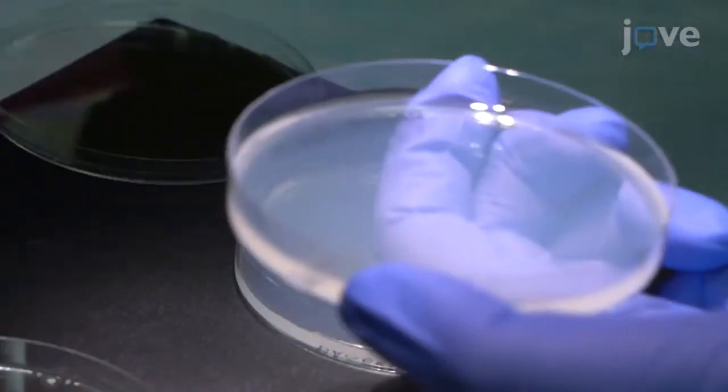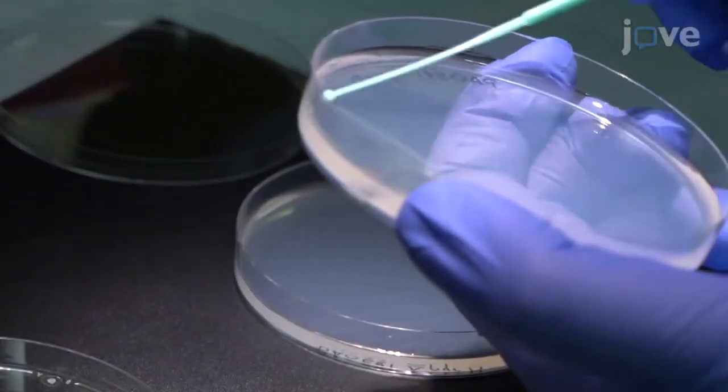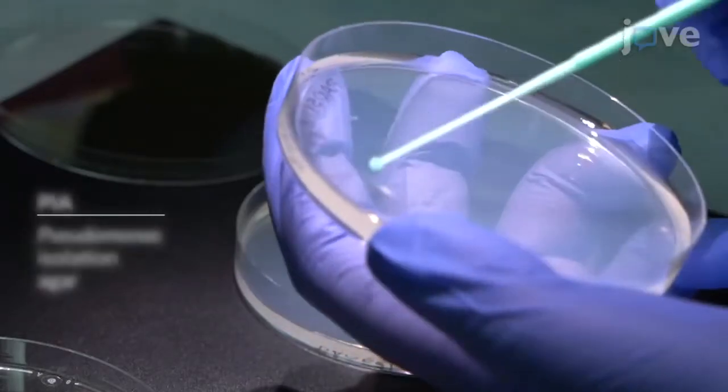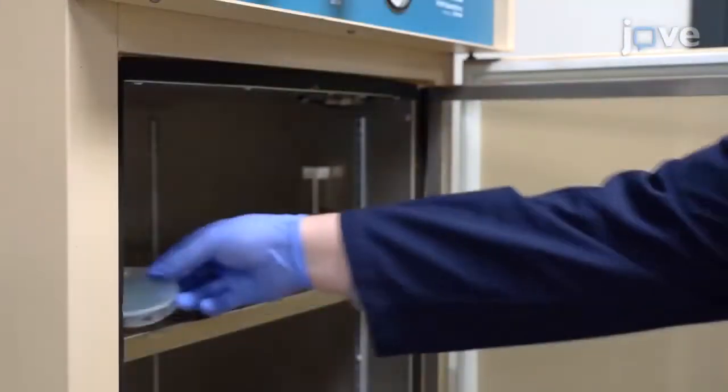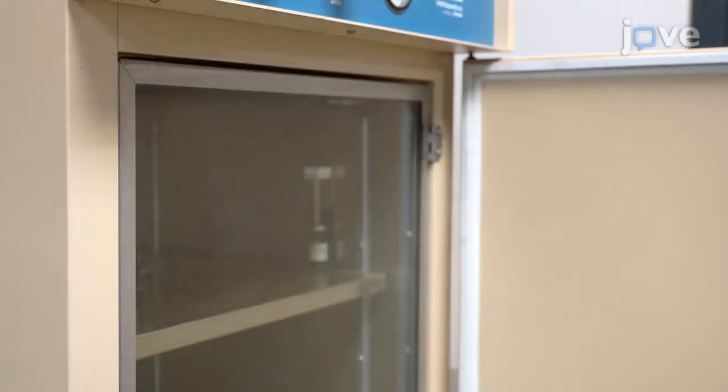To detect the small colony variant, or SCV, first treat the P. aeruginosa strain PAO-1-delta-PYRD on pre-warmed PIA plates. Grow the strains at 37 degrees Celsius for 48 hours.